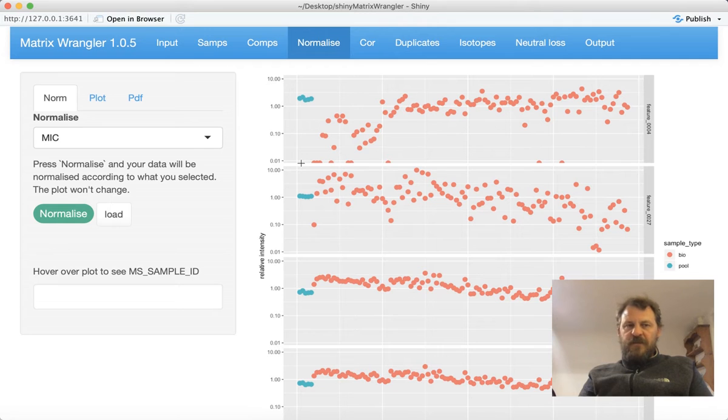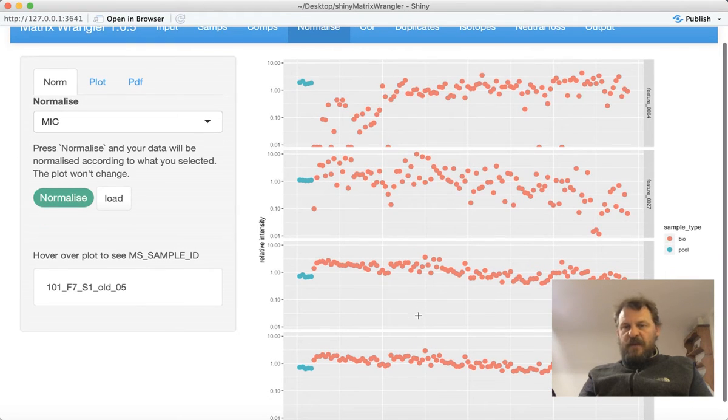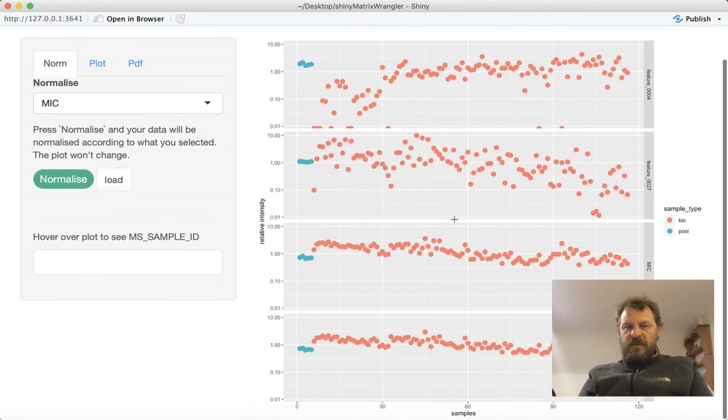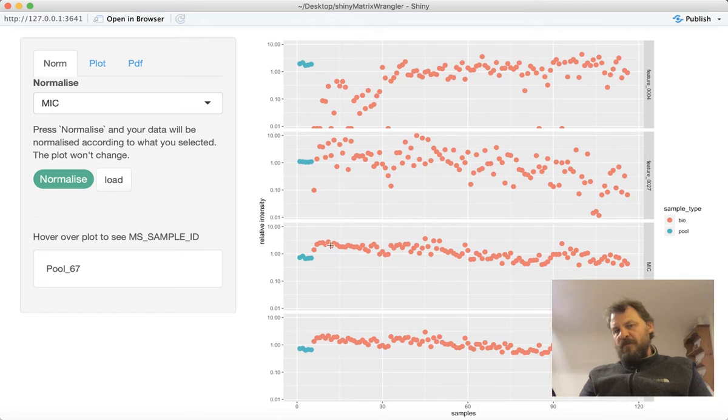we've got, in untargeted, two things for free that might be quite useful for normalization, and these two things are the MIC and the TIC. The MIC is the median, whereas the TIC is the sum over all intensities per sample. If we look at this here, we see that our first 5 samples, which were the pool, are quite a lot lower than the rest. Then we go up, and then there's a drift downwards as the experiment carries on. I don't know for sure whether this is the order of the experiment, but it looks very much like it is.